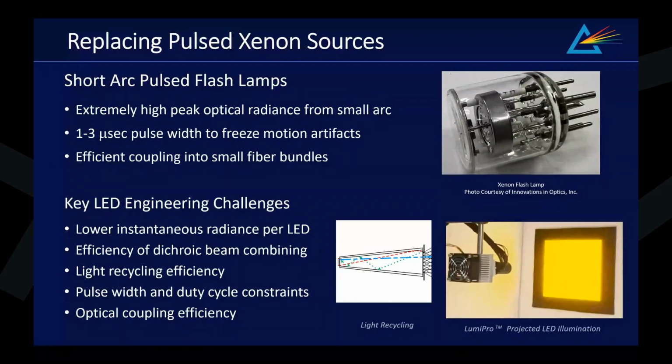One advantage of LEDs over arc lamps is their ability to operate at significantly higher duty factors and frequencies, which can help make up some of the ground. Another advantage is the independent spectral control. Only recently can many, but not all, applications for short arc xenon lamps be replaced by solid state systems.